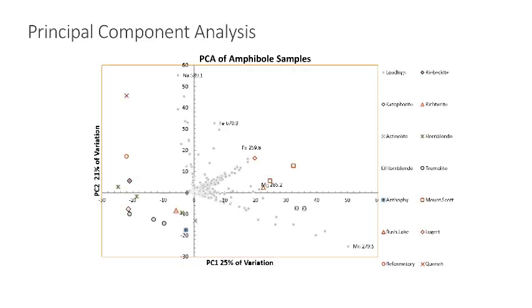A more complicated technique for resolving differences is principal component analysis. Here we use the entire spectrum from one grain and compare it to a spectrum from another, and another, and another. Those with similar spectra should plot close together on this graph. Those with vastly different characteristics should plot further apart. The gray dots in the background even tell us which peaks are participating in moving the differences, and their directionality and intensity tells us how different those peaks are.